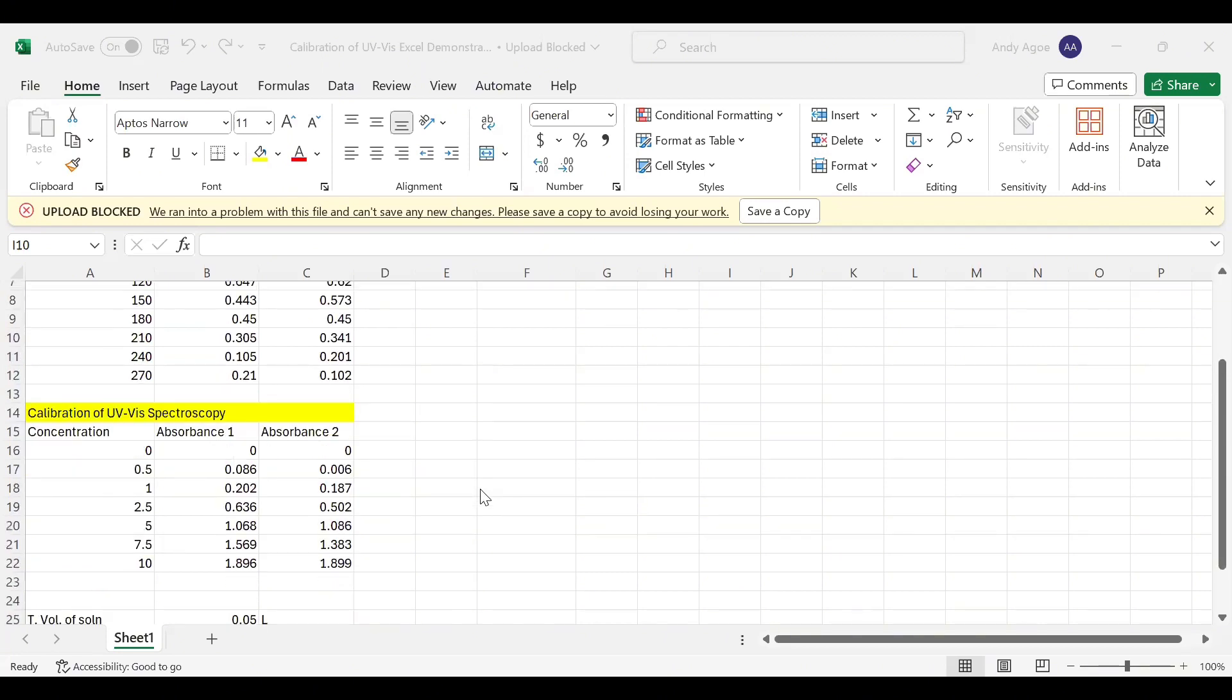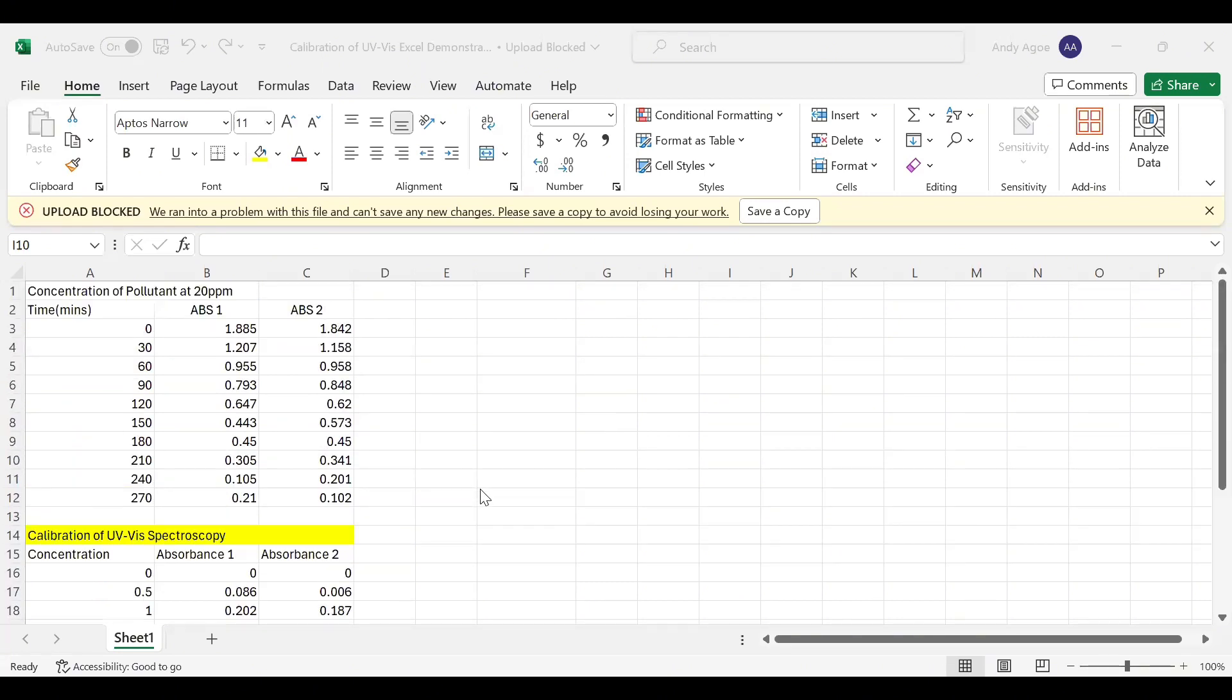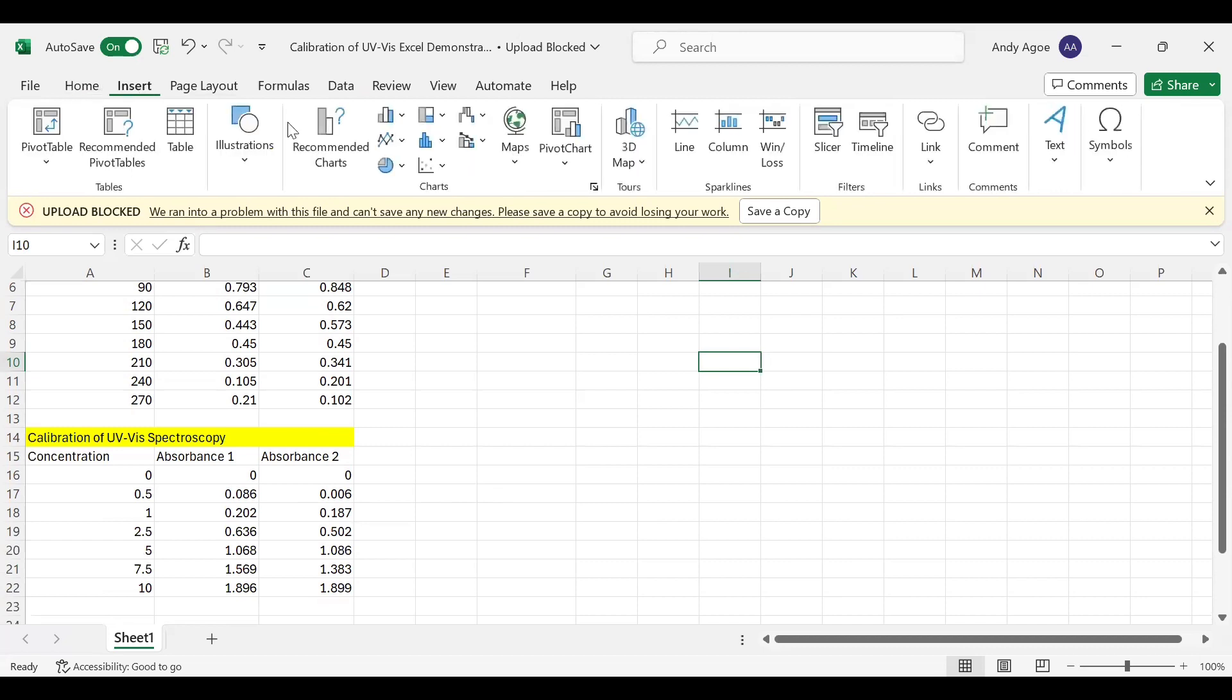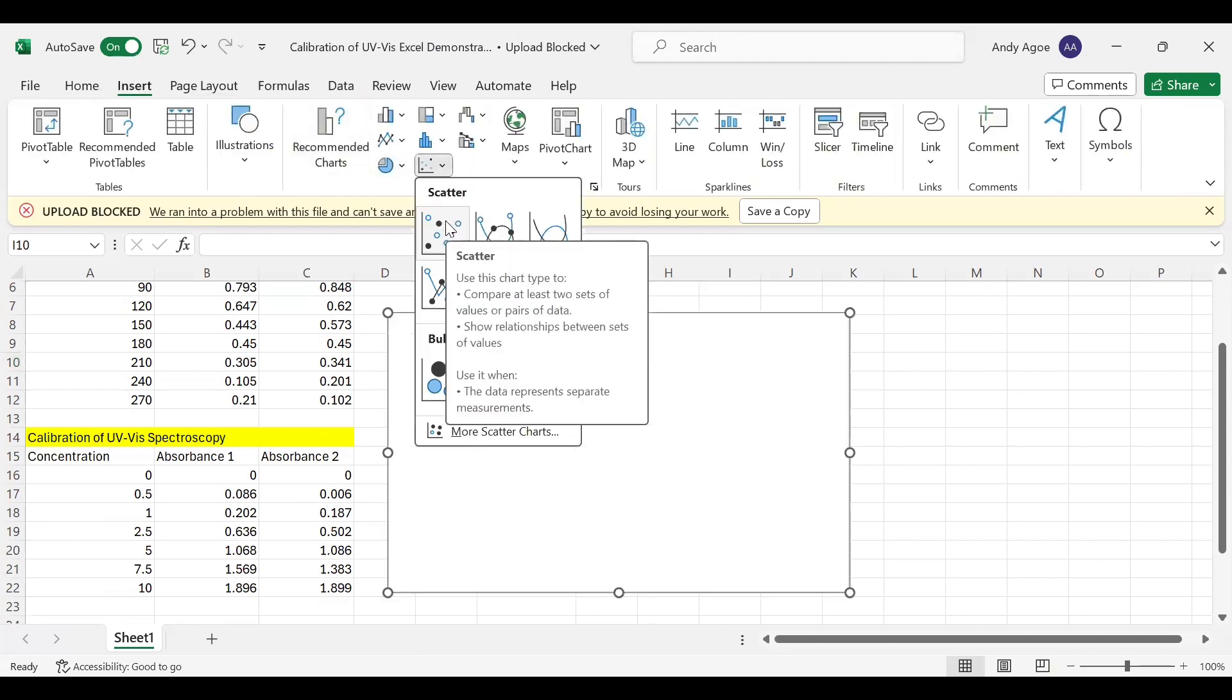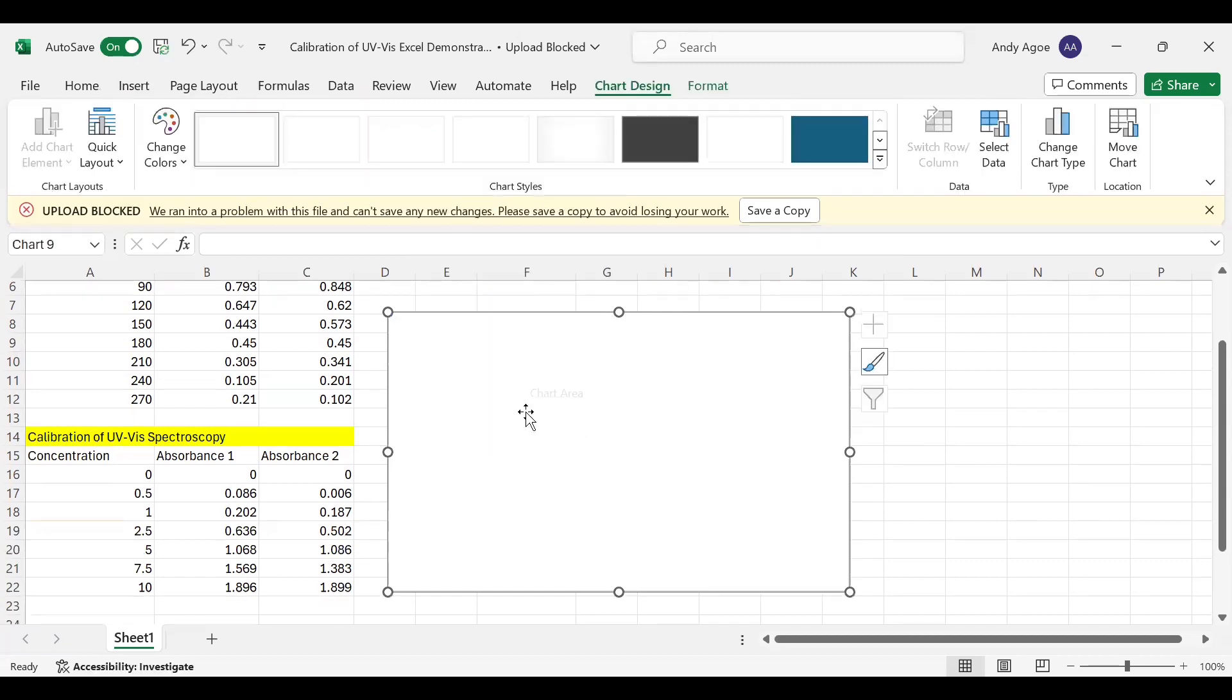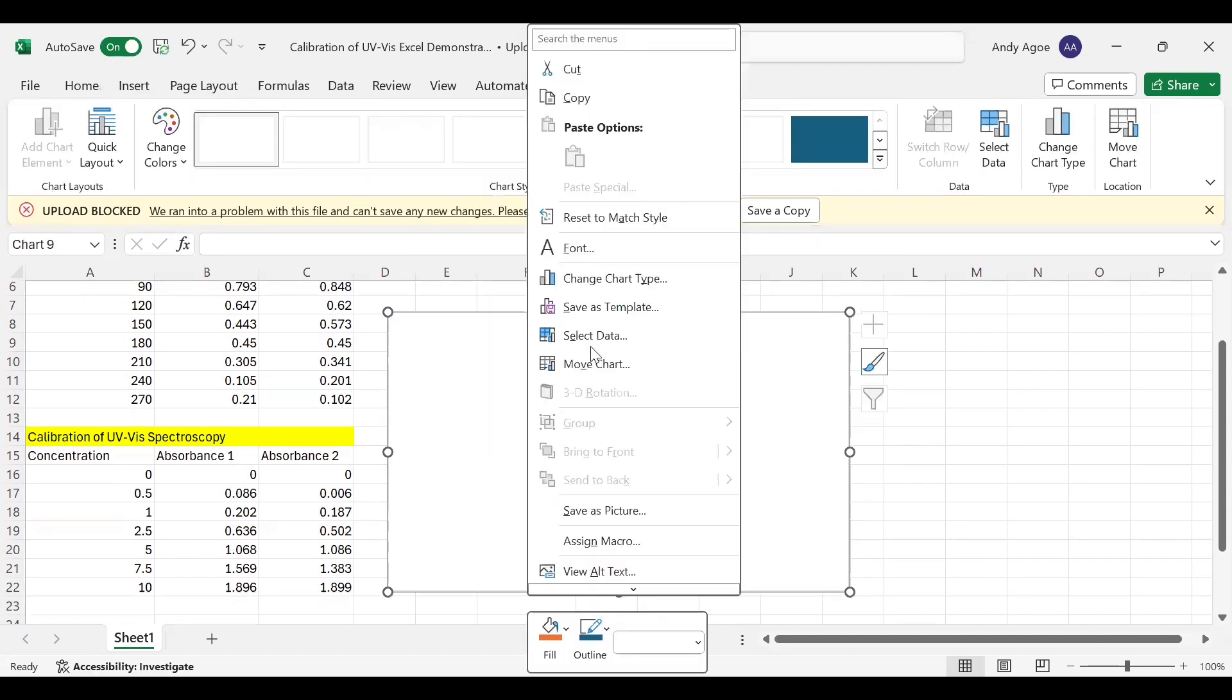For this demonstration, I've assumed some values of absorbance at a corresponding time. Now to plot, we need to select an empty space of the spreadsheet, then we move to the Insert tab, go to Charts, then pick the Scatter. Now click on the plot area, then click on Select Data.